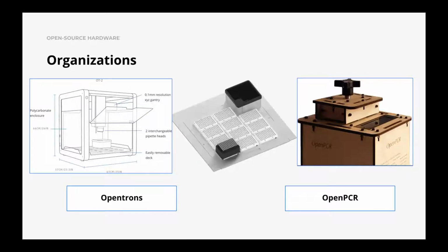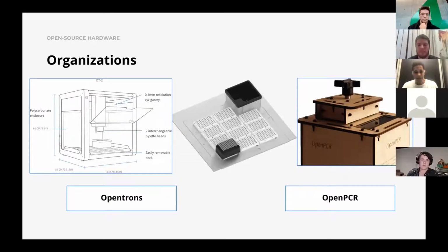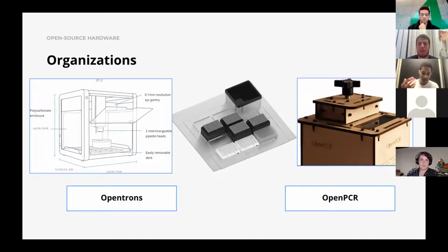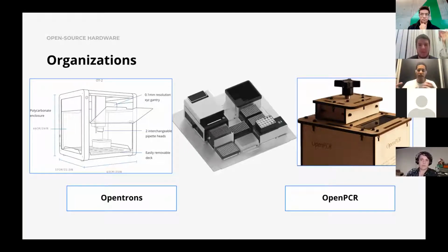So the Opentrons robot is really great, I think. And I'm still at Opentrons because of it, because it just really is a flexible tool that can be used in so many different ways. And all of our code is on GitHub. It's open source. Our hardware schematics are also open source on GitHub. And so we have this kind of guided way as to how maybe a user might use the OT2, but there are plenty of people out there who've transformed the robot and made it into something completely different than how we kind of envisioned it.